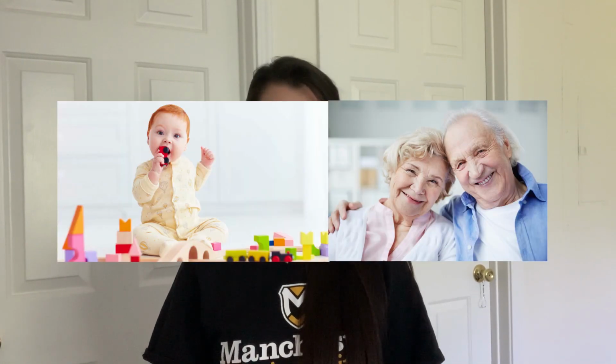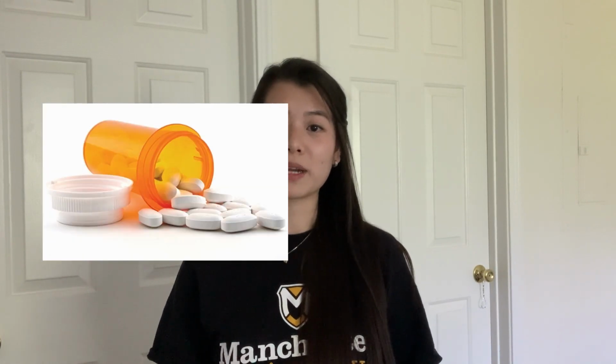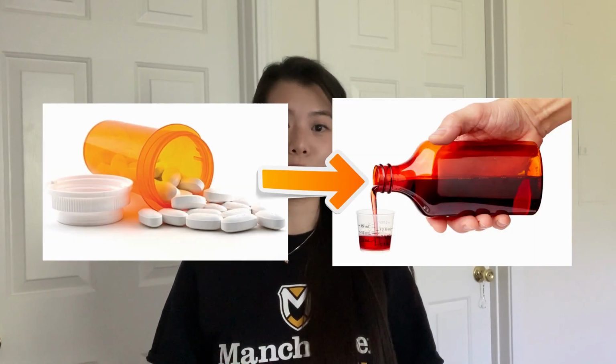Alright, let's get started. So like I said, I'm going to be making a cookies and cream pudding that is going to be mimicking the creation of a suspension in the pharmacy. Suspensions are commonly compounded because not everyone can swallow a tablet very easily, such as babies and older patients, because they run the risk of choking. So that's where we come in. As a pharmacist or a pharmacy intern, you can turn a solid medication into a liquid form or any other form to make it more comfortable for our patients to take their medications.